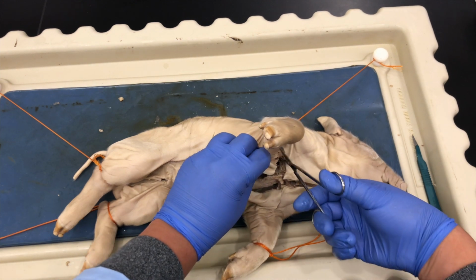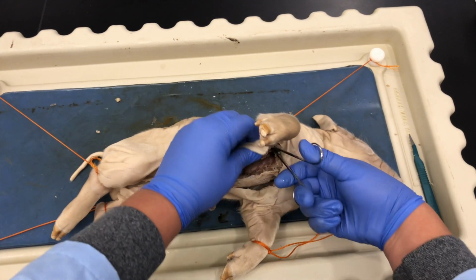I continued the cutting, aiming to go behind the forelimb.